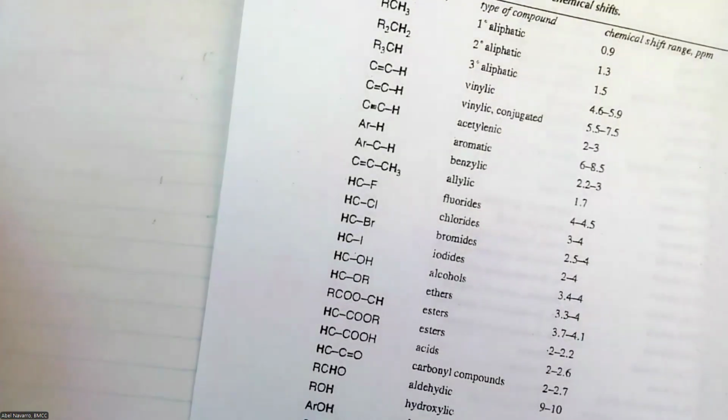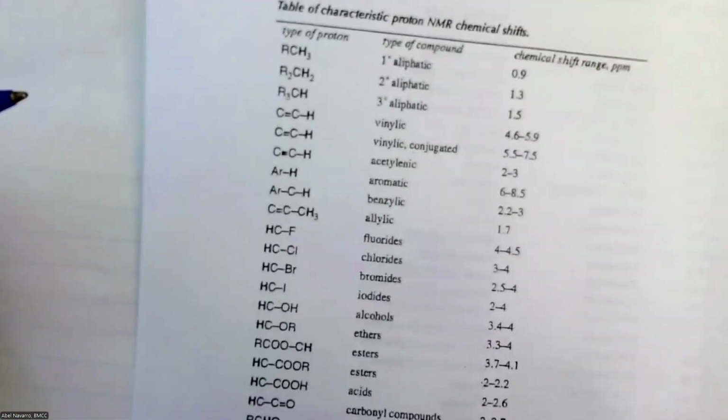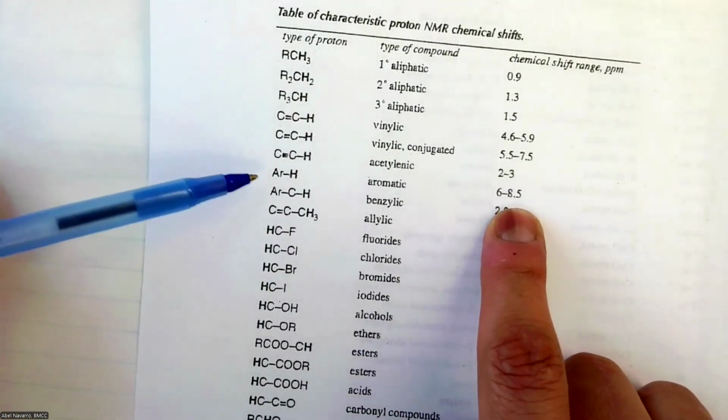As we said, it will be more to the left side. But why is aromatic 6 and 8.5 if the hydrogen is next to a carbon? Aromatic, right?